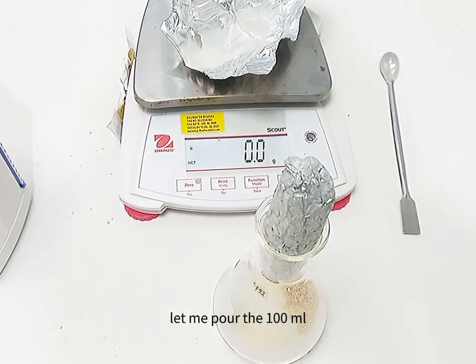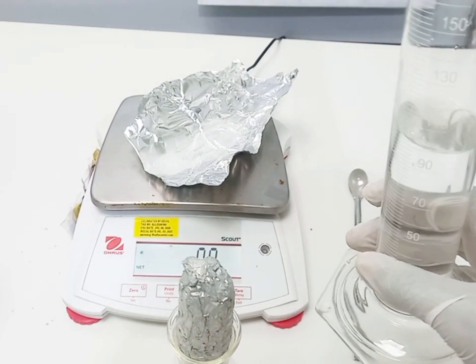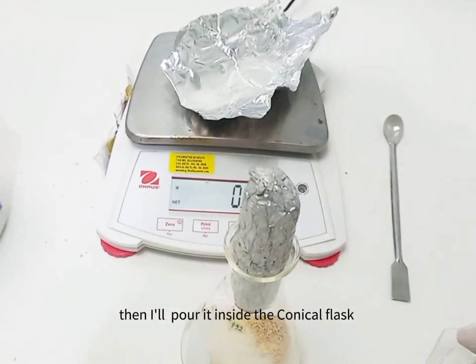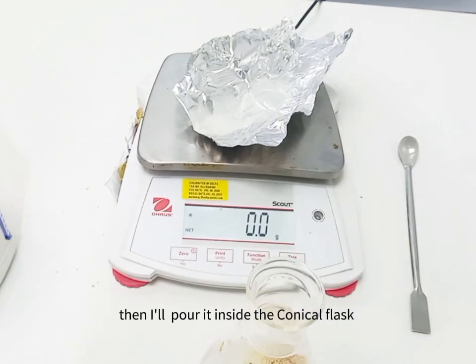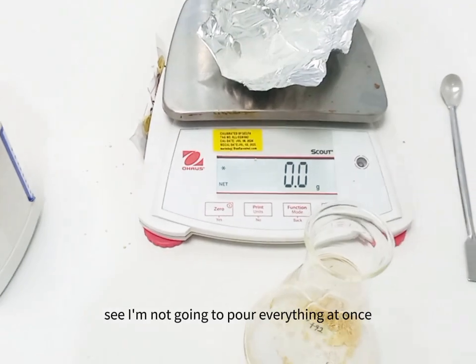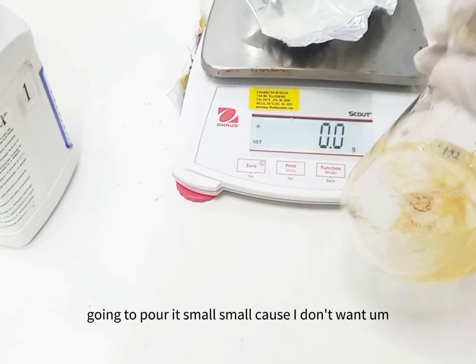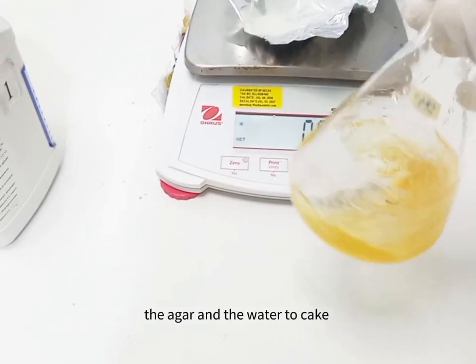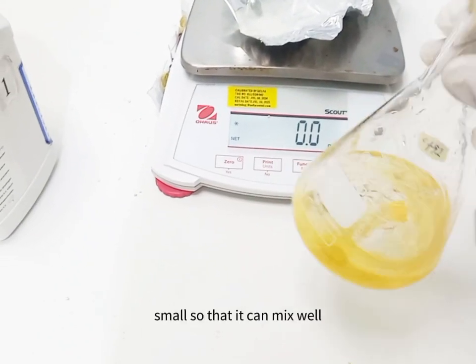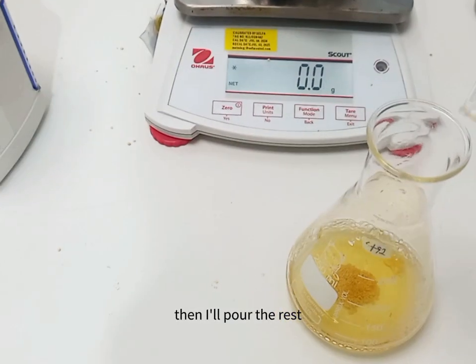Let me pour the 100 ml of distilled water for you to see. So making use of my measuring cylinder. I don't know if you can see it well from here, but this is 100 ml. Then I'll pour it inside the conical flask. See, I'm not going to pour everything at once. I'm going to pour it small because I don't want the agar and the water to cake. I want it to dissolve well. So I'm going to pour it small so that it can mix well. Then I'll pour the rest.